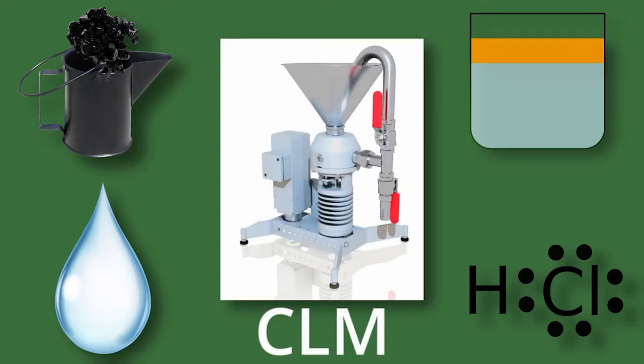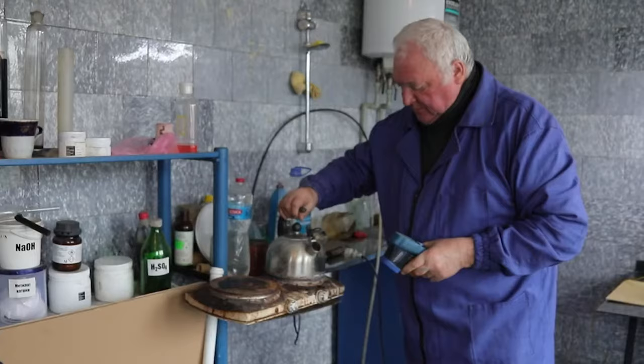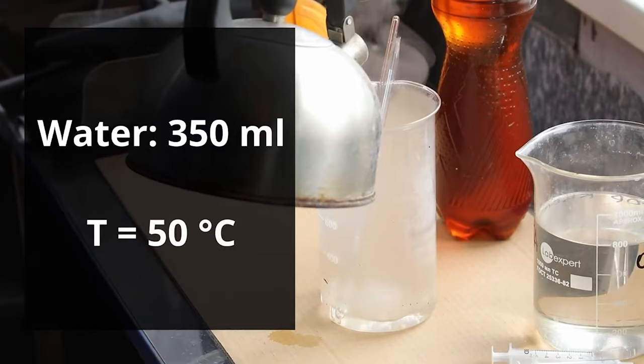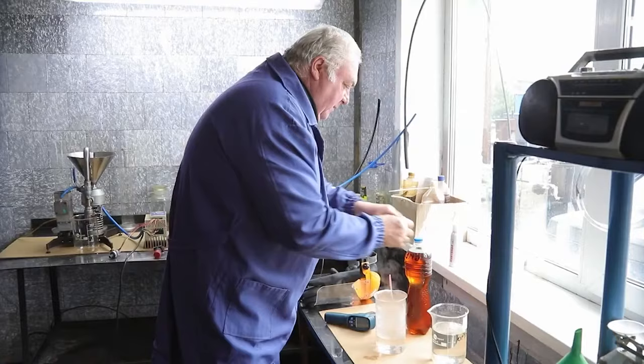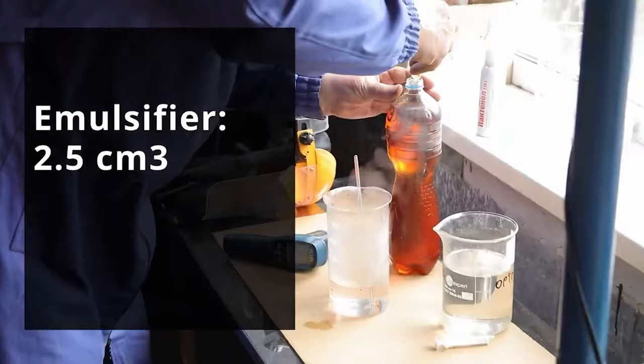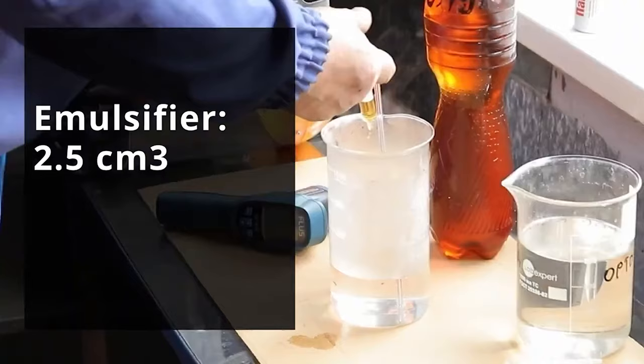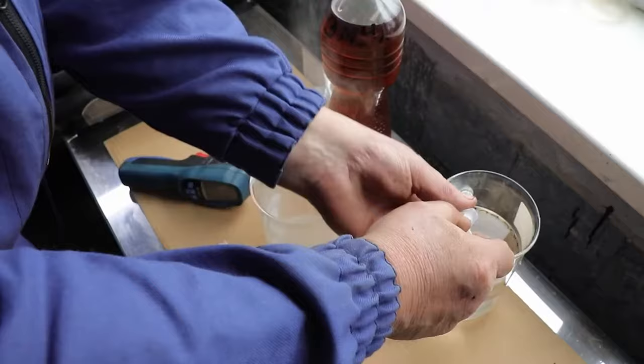So, let's start. First, a blend should be prepared. We take 350 milliliters of water which we have previously heated to the temperature of 50 degrees Celsius. Next, we take 2.5 cubic centimeters of emulsifier, add it to water, and mix it all.